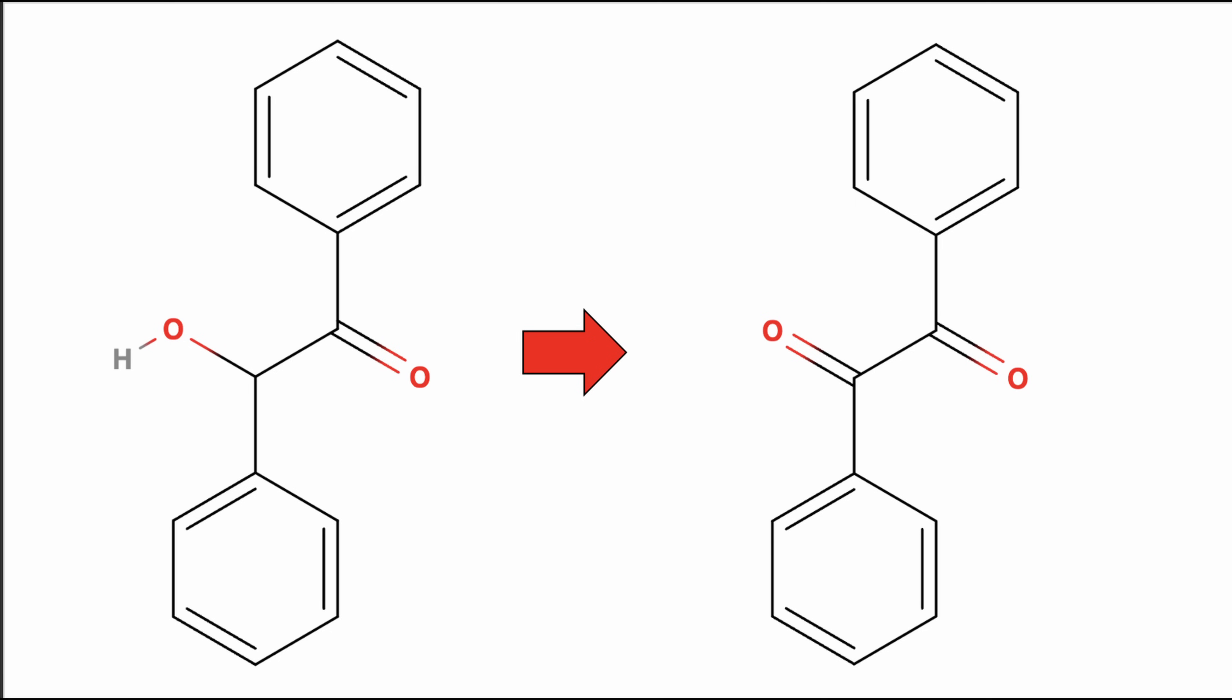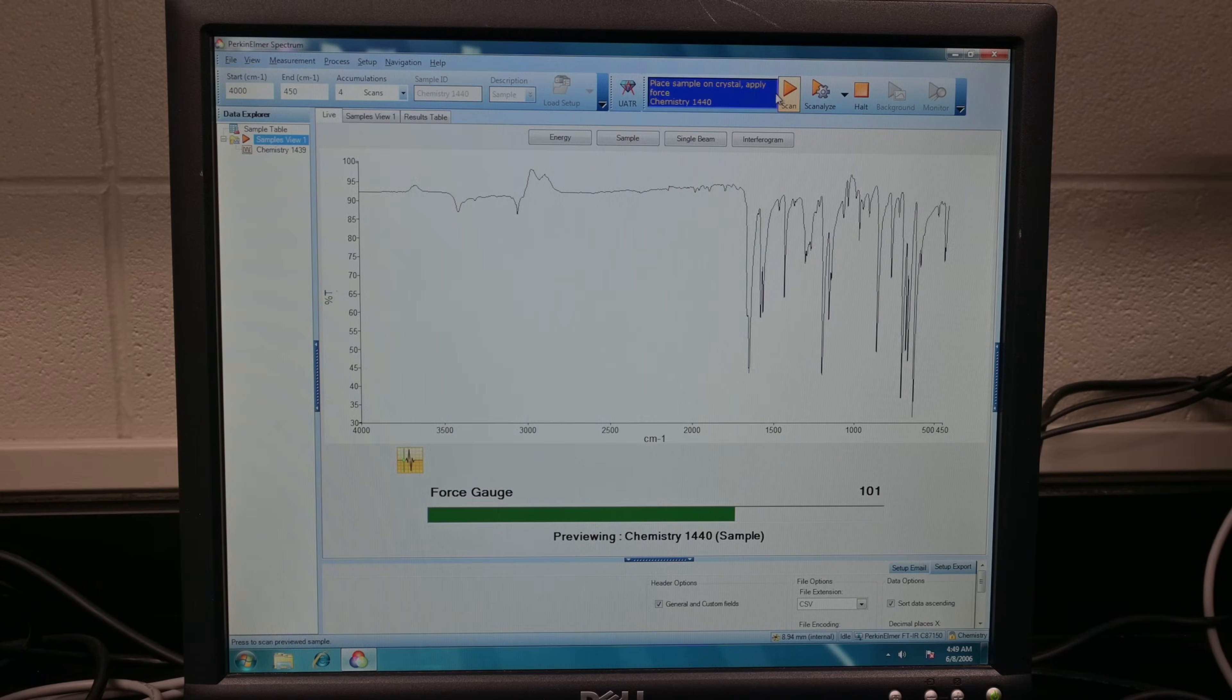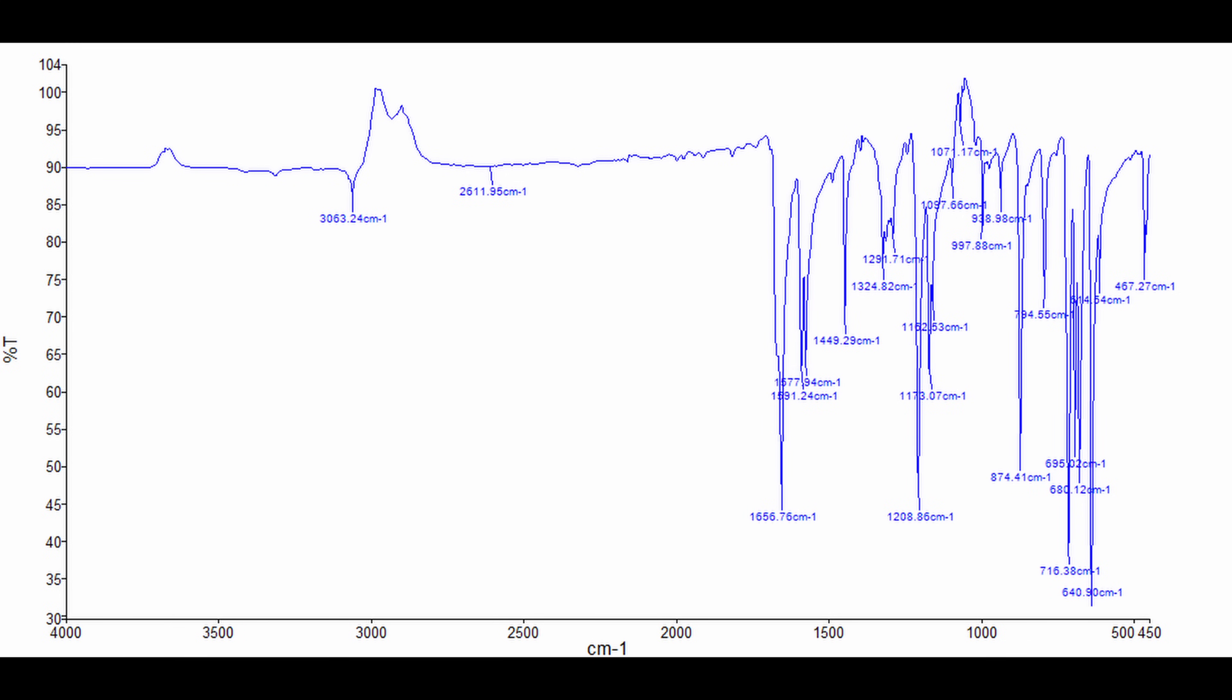When benzoin is oxidized to benzil, a new set of identifiable changes emerged in the FTIR spectrum, reflecting the chemical transformation clearly. Benzil, a diketone structure, is readily distinguished by the disappearance of broad hydroxyl peaks present in benzoin, confirming the removal of the alcohol group during oxidation. Instead, benzil exhibits two intense distinctive carbonyl stretching vibrations occurring between 1685 and 1665. The absence of any broad peaks around 3400 signifies a successful oxidation reinforcing the purity and accuracy of the benzil synthesis.